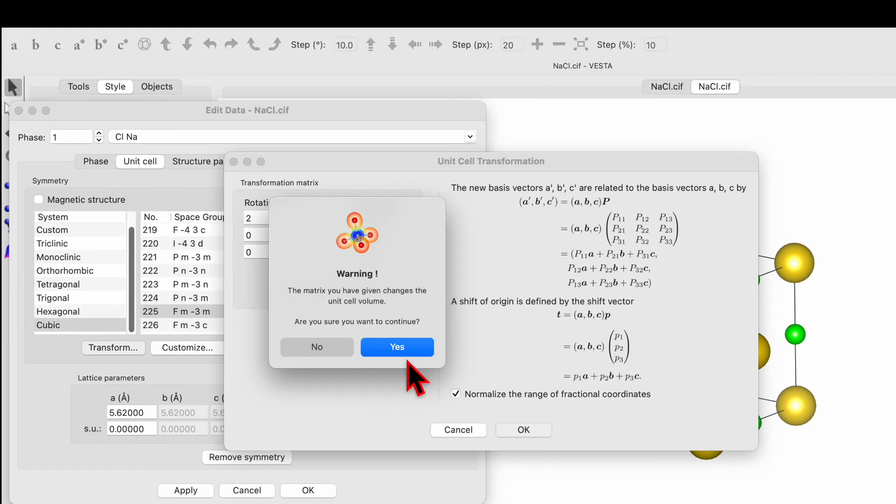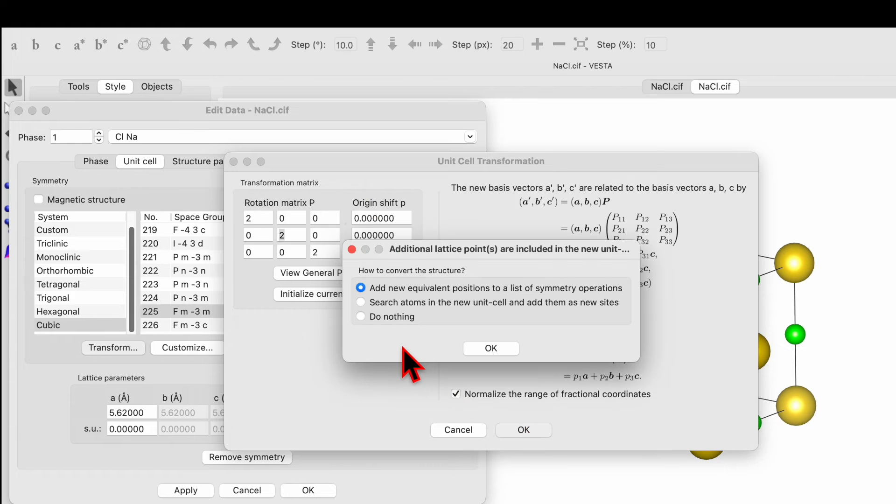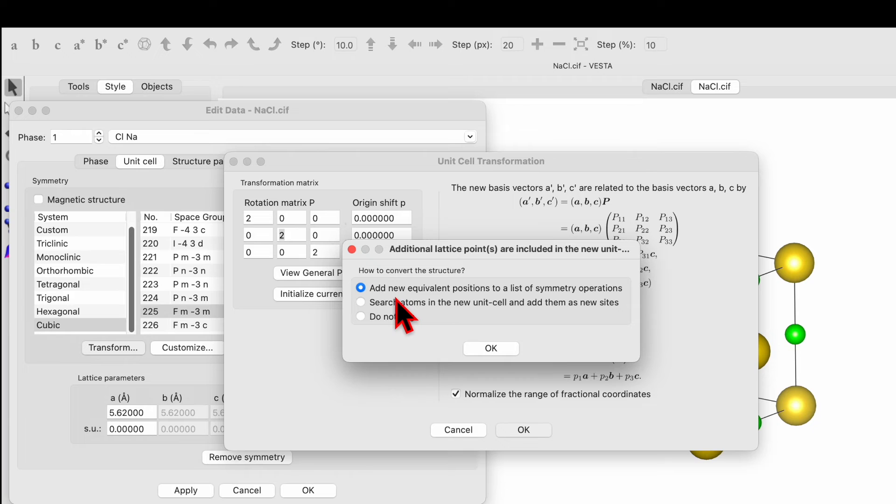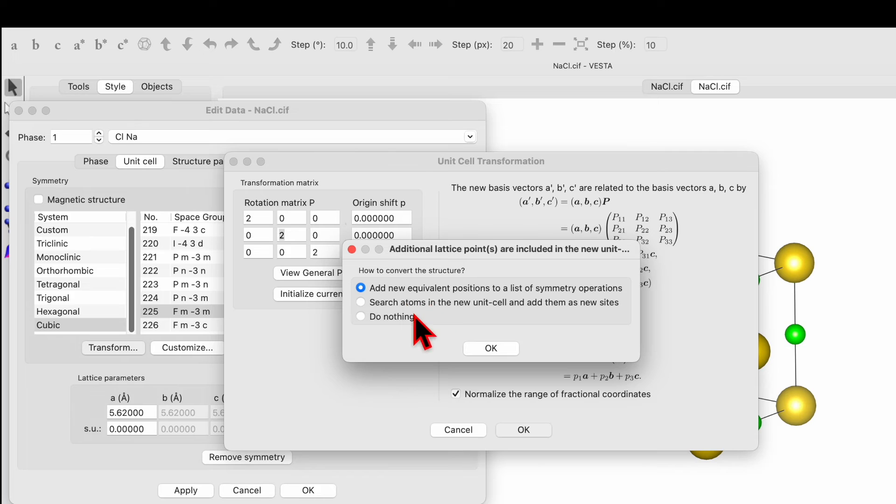Click yes and it will ask you add a new equivalent position to the list of symmetric operations, search atom in the new unit cell and add them as a new site, do nothing. So just check the default option, that's number one.